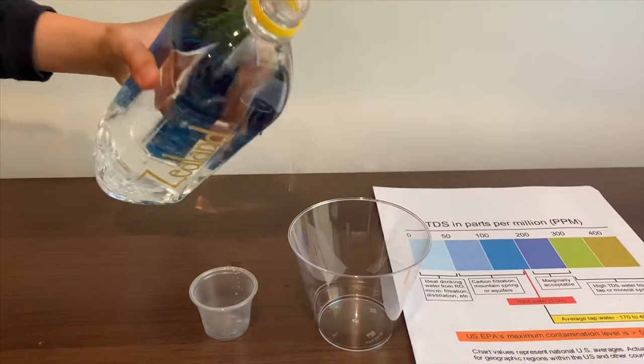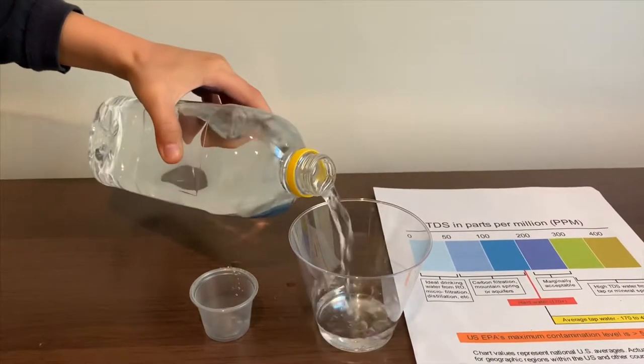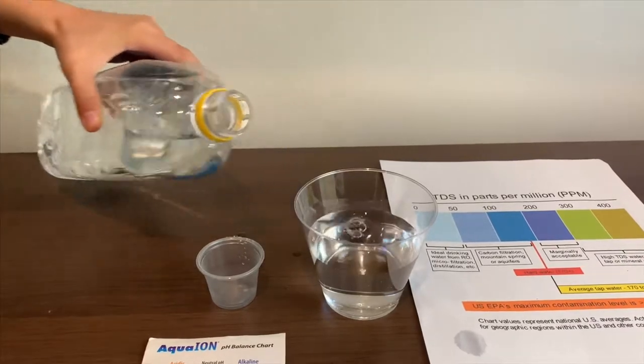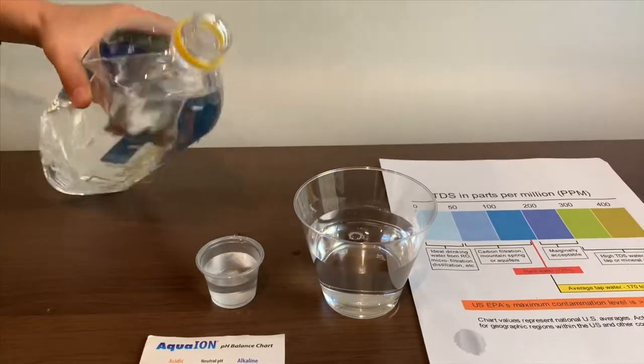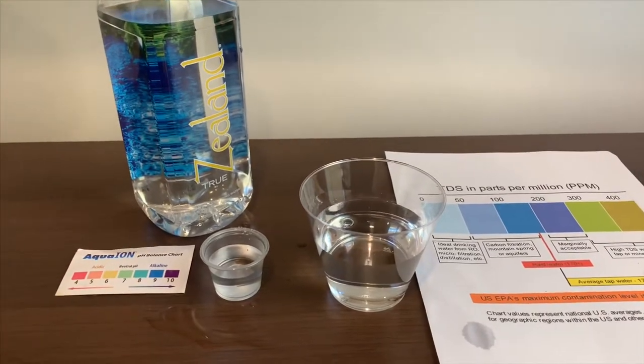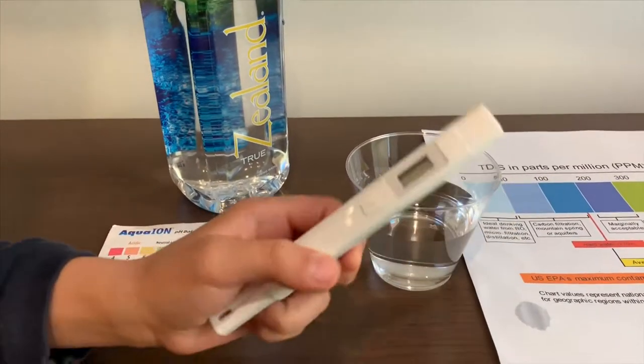Let's pour some water in. First, we're going to test the TDS level.